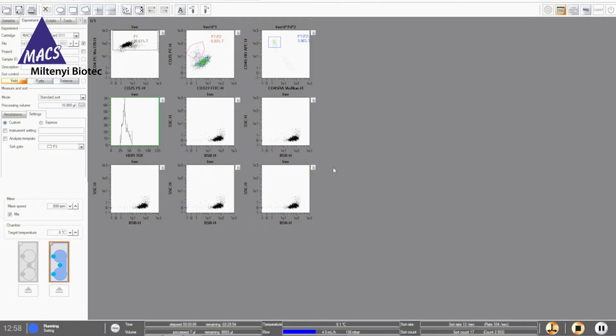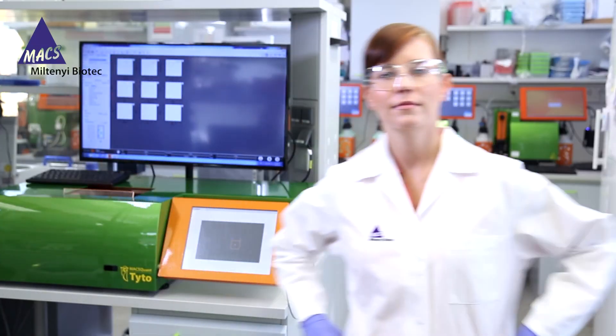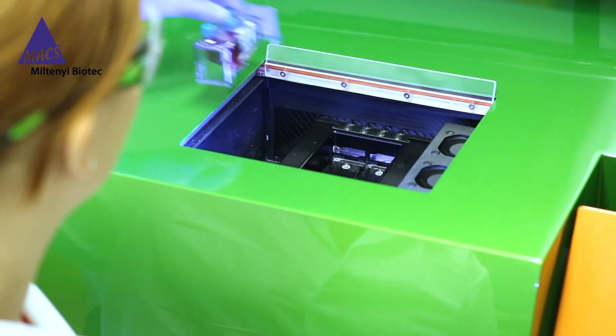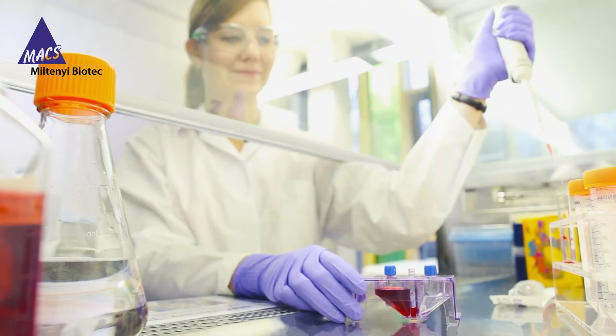The actual sorting process is completely operator-free. Once the sort has finished, you can take the cartridge out of the instrument and retrieve your sample under a sterile hood for further processing.